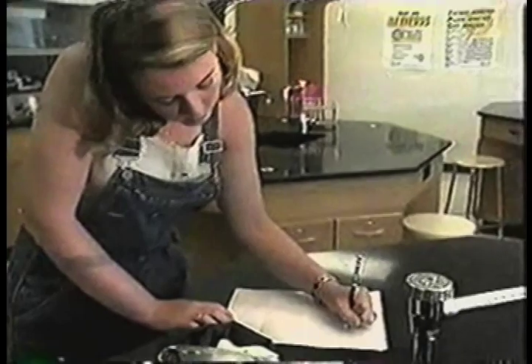People can become seriously injured in a lab. Keep that in mind every time you walk. Don't run through the door. You need to know where your safety equipment is now. That way, in the excitement of an accident, you won't be running around looking for it.